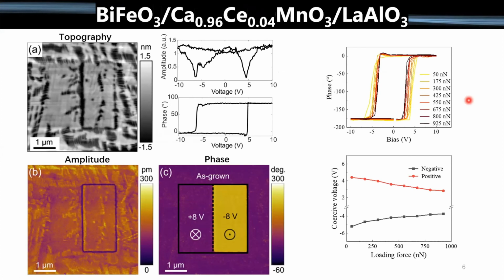We do a tip reconstruction by looking at an array of sharp needle calibration sample, and we can see that the tip doesn't change very much over time. I should also highlight that after we do the machining, there's actually pileup, and we remove the pileup with the same tip, and the tip shape tends to help the pileup move away from the apex of the probe. The apex of the probe remains relatively as sharp as when we started.